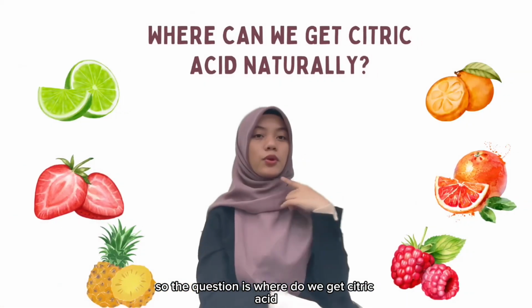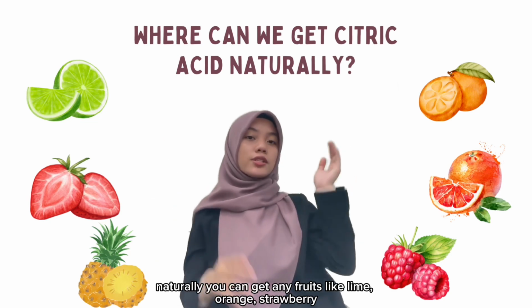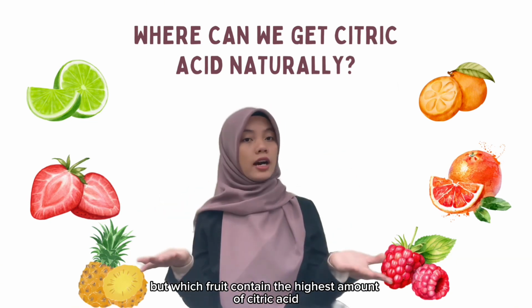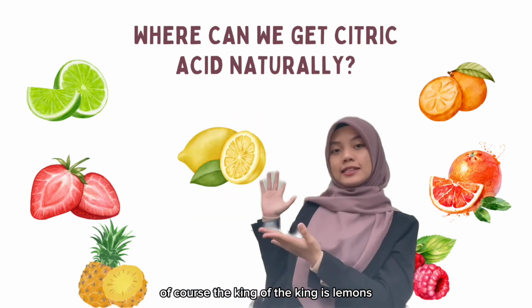So the question is, where do we get citric acid naturally? We can get it in fruits like lime, orange, strawberry, grapefruit, pineapple, and raspberry. But which fruit contains the highest amount of citric acid? Of course, the king of the kings is lemons.